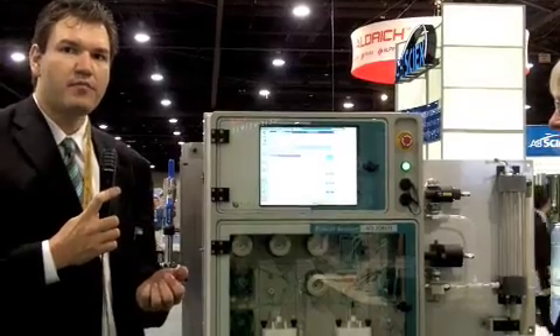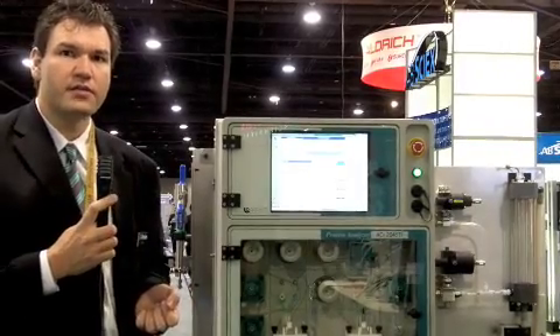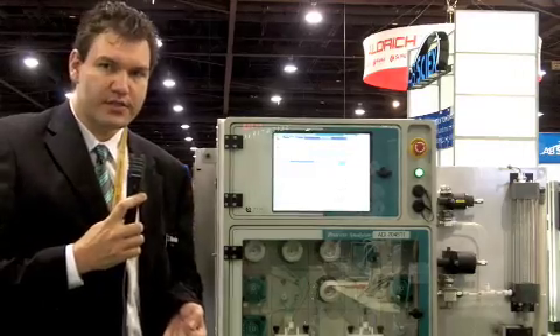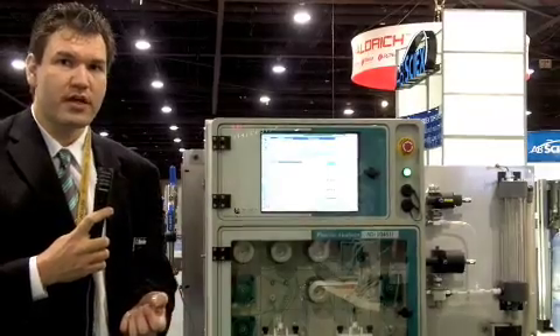In terms of specific applications, the most important ones include mining. We also have applications in semiconductor and photovoltaic industries. In those production processes, most important is the analysis of acid mixtures, which are used to treat surfaces that must be in a certain condition to make the later products successful.